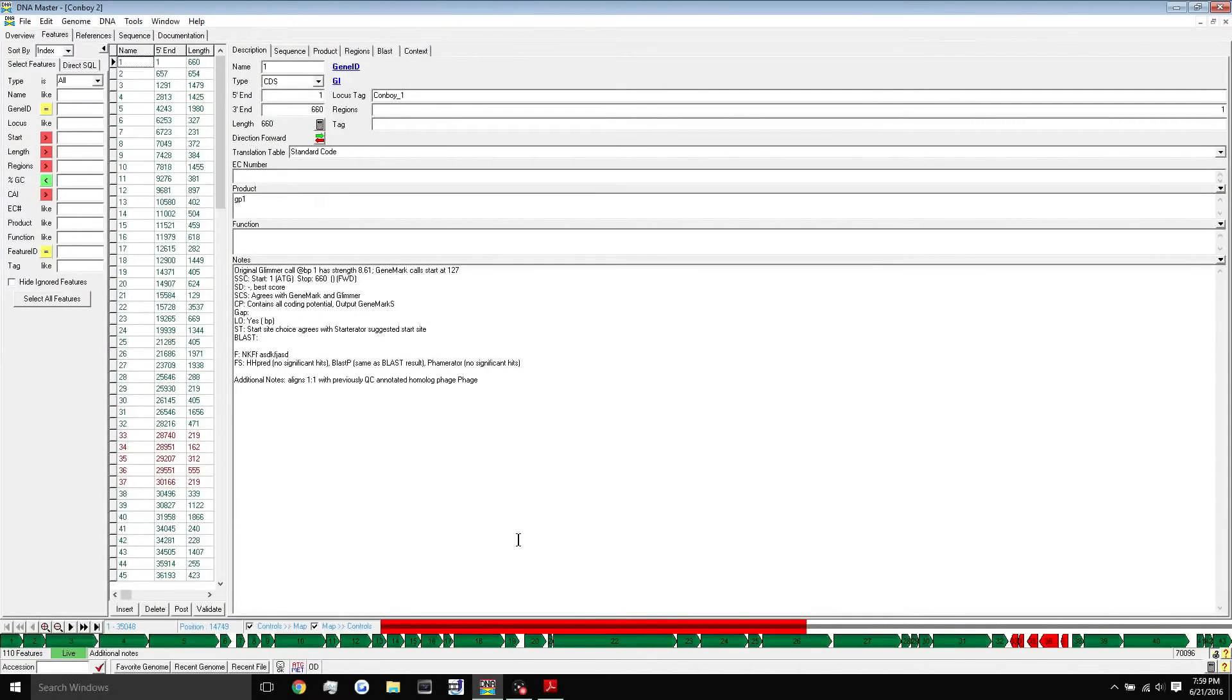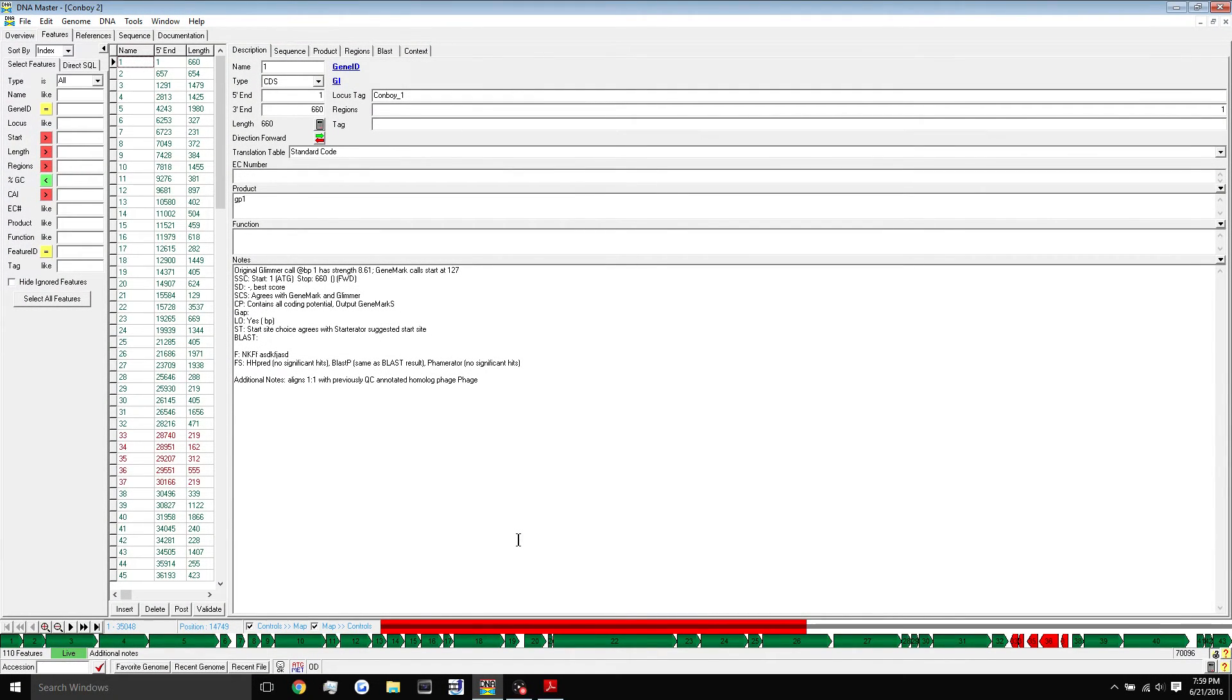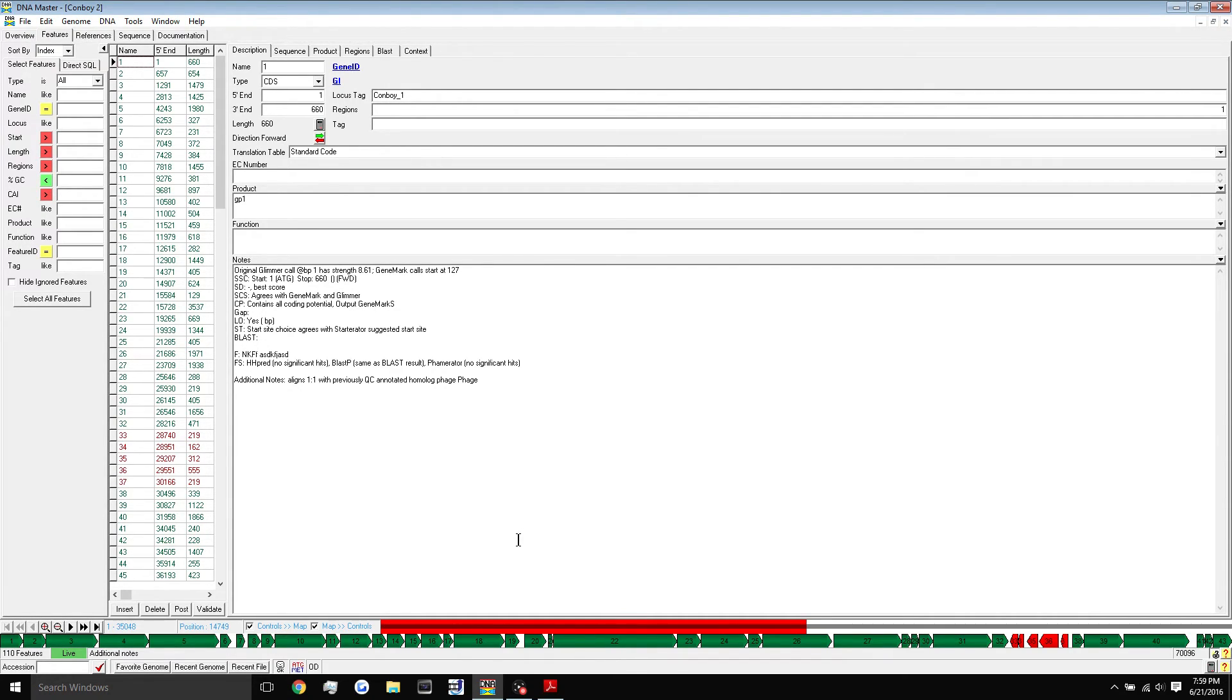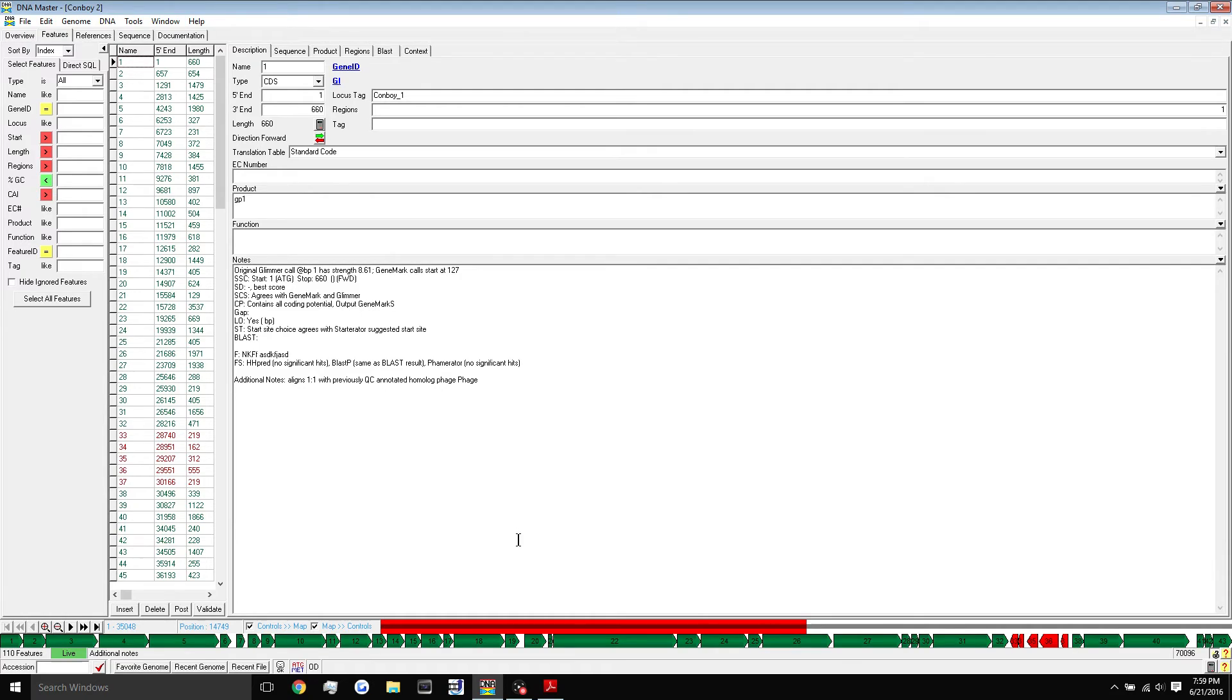Hey everyone, welcome to your fourth DNA Master tutorial. In this tutorial I'll be showing you guys the basics of DNA Master. I'll show you around the program, show you how to access all the tools that you'll be needing, and just show you how the program is laid out.